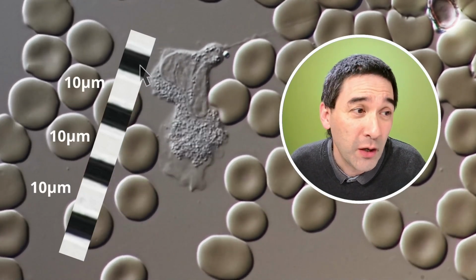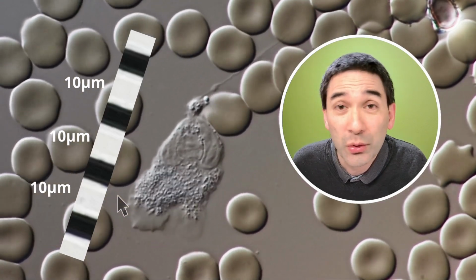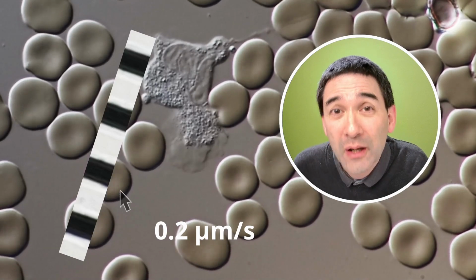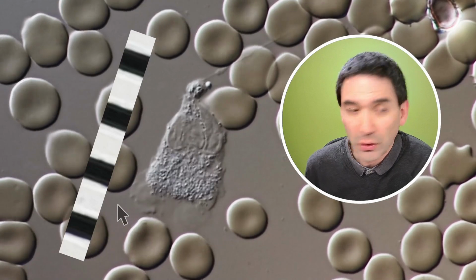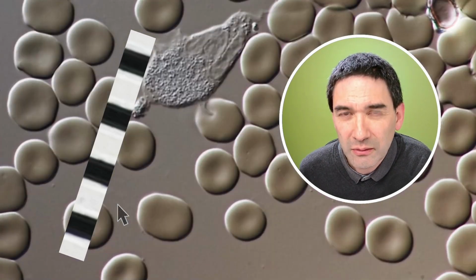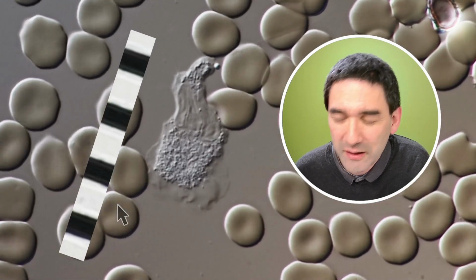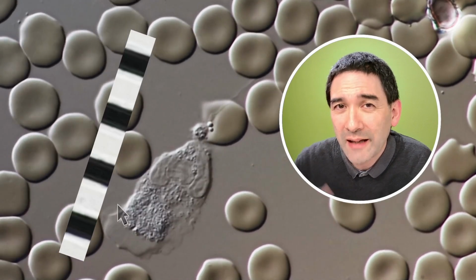If you now know the distance, it's basically 25 micrometers in 131 seconds. And if we do that math, you're going to get approximately 0.2 micrometers per second. I've got a little cheat sheet here in front of me. It's quite less than a millionth of a meter per second. That's quite slow, right?